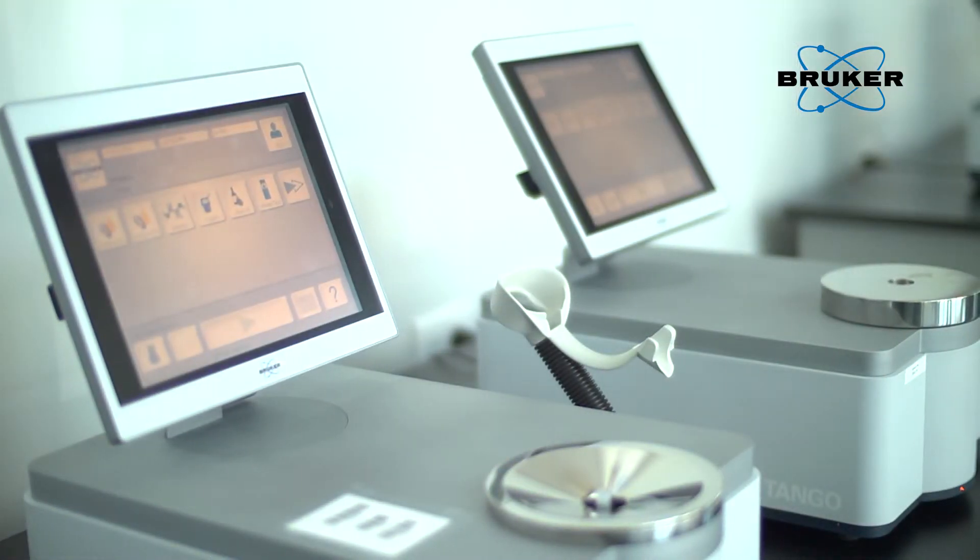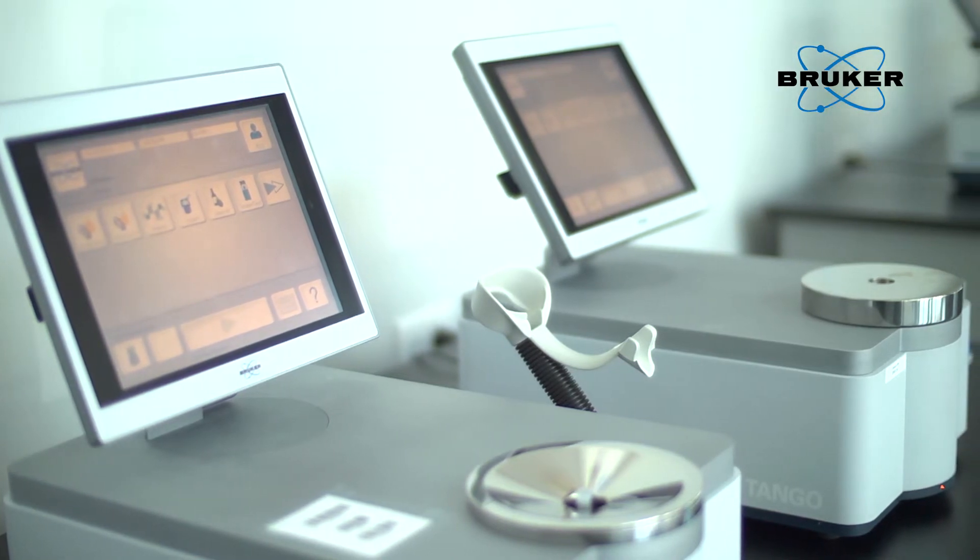The Tango-T is a high performance, rugged FT-NIR spectrometer which enables fast and accurate analysis for measuring several quality parameters in your liquid chemicals.